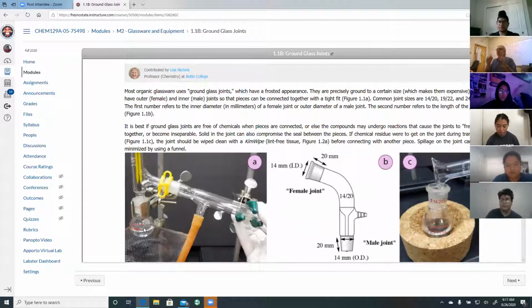They're called round bottom flask. I have an example in my hand. It's a round bottom flask. On top of it, this guy is called a distillation head. There is a joint here. There is something on top of it, and there's a thermometer that's stuck inside. There is another ground glass joint.